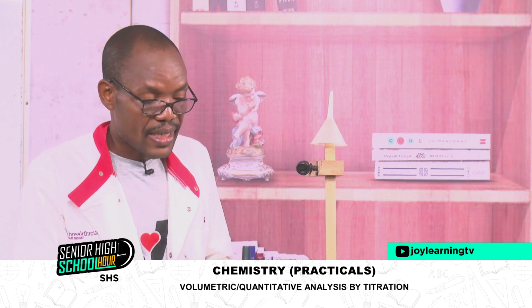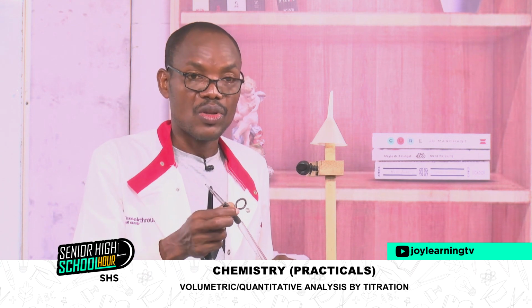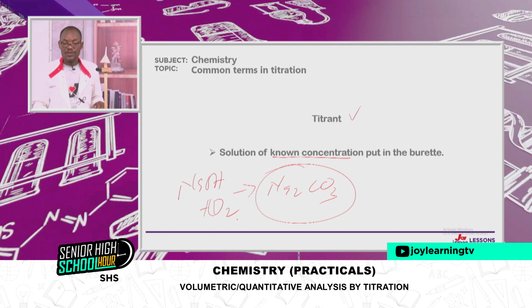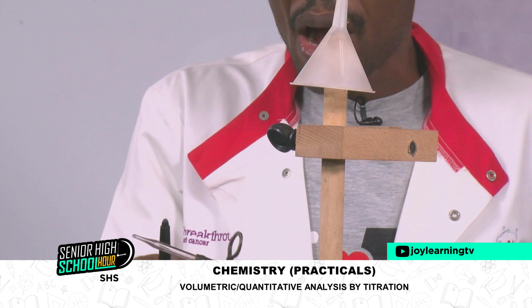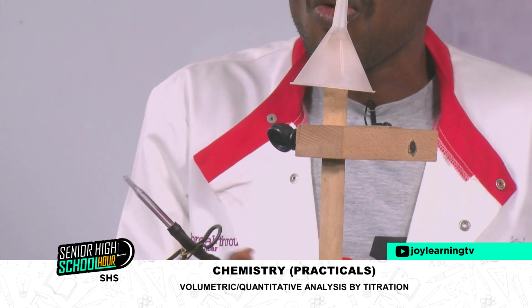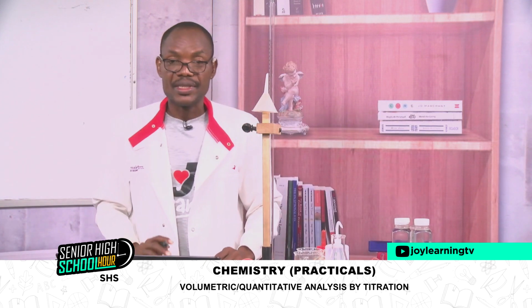So if you are using sodium hydroxide in a burette that has a cork, or the tap is glass, immediately you finish work, you need to rinse inside well with a lot of water so that there will not be any traces of the sodium hydroxide to react with the carbon (IV) oxide in air to give you the sodium carbonate that seals the cork to the main burette. That is another reason why most of our school labs have these ones there. So take note. If you are using a base, rinse with a lot of water immediately work is over. So anytime I put a solution into the burette, that solution becomes the titrant.